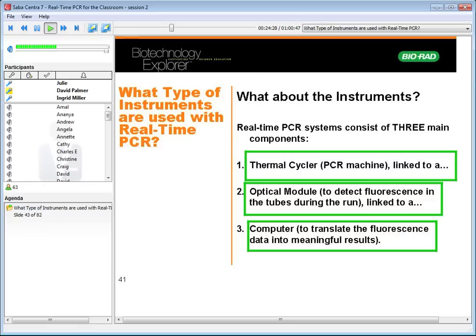And this isn't required so much for just demonstrating real-time PCR in the reaction or in the classroom, but if you want to have reactions where you can do quantification, accurate quantification, it's a good idea to optimize and at least be able to explain to the students how to optimize PCR.